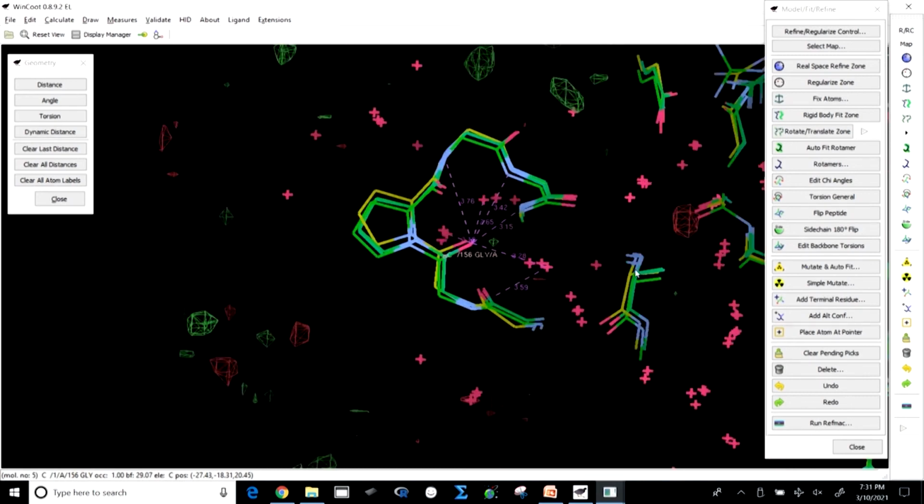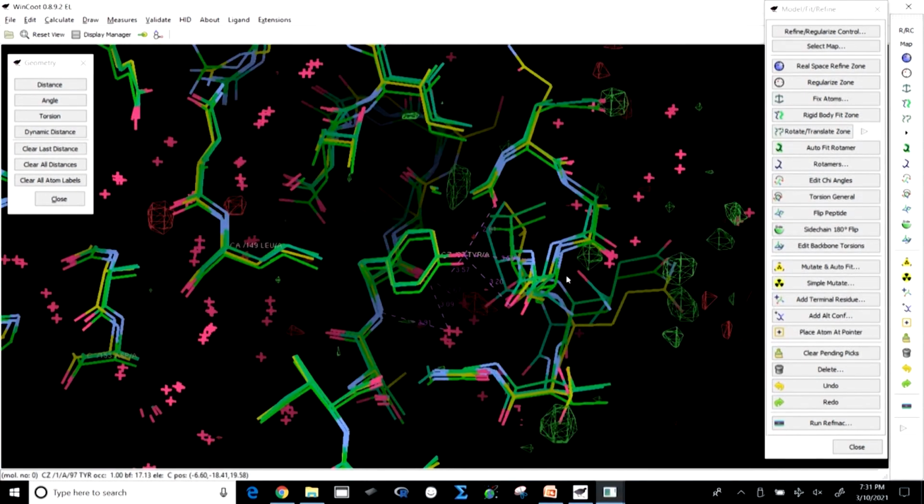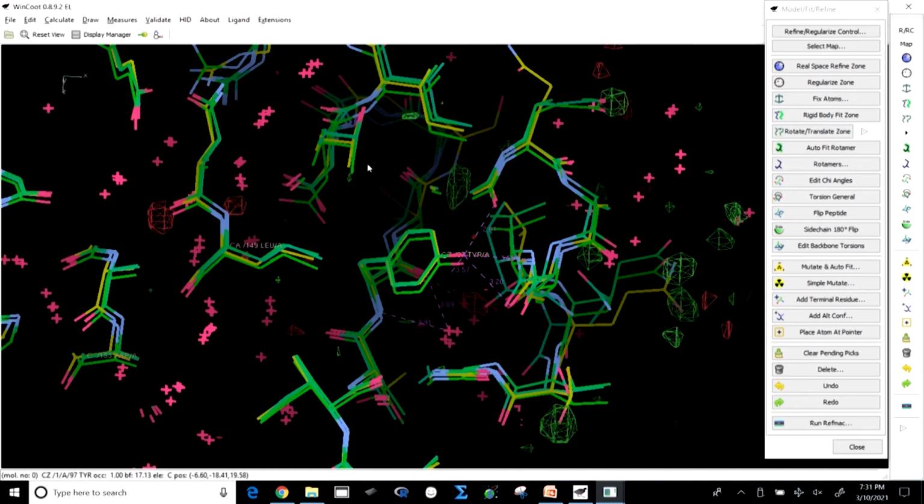So, these are giving you introspection to understand in-depth knowledge about the chemistry behind the enzymatic mechanism. So, in short, we have seen there are lots of options.